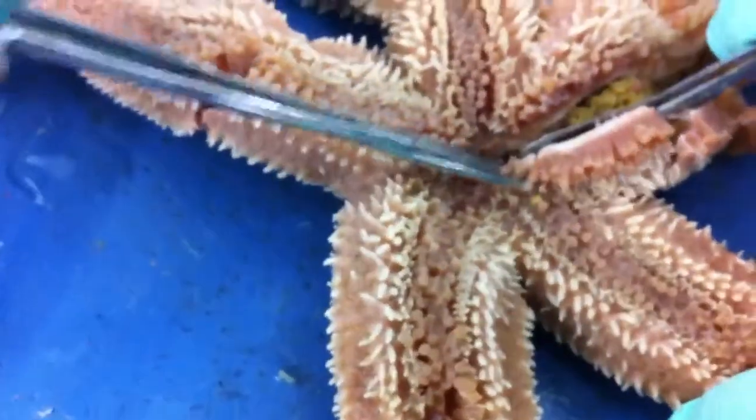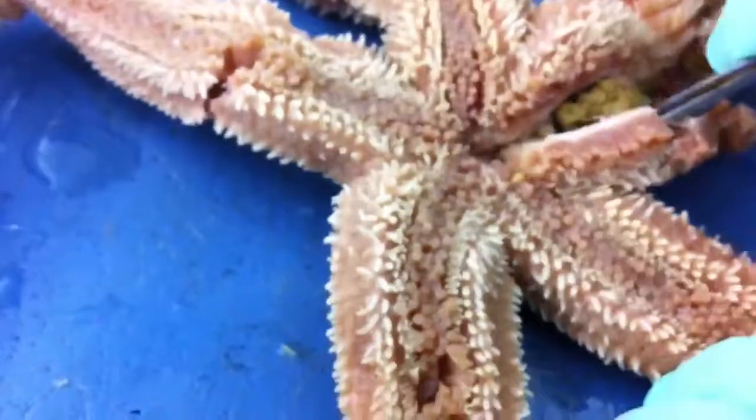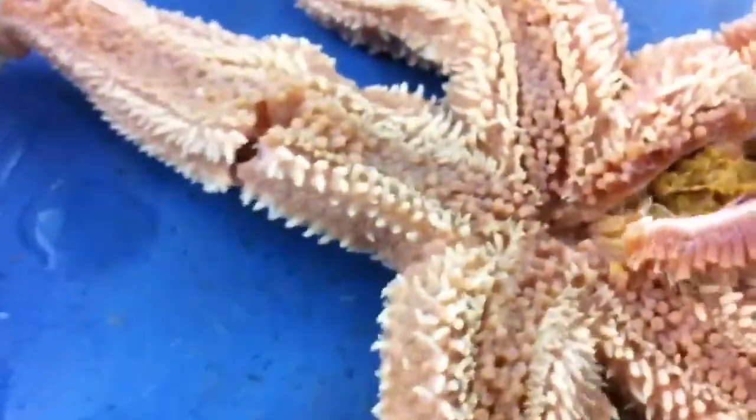I don't know if that helps, but... is that starting to smell? Whatever, we'll get it out of the way one way or another.